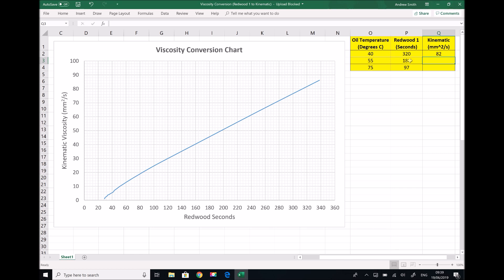We can repeat for 188 Redwood seconds. We have 180 and 5 increments up to 200, so each increment is 4 seconds — we go along 2 squares to 188. Tracking upwards until we strike the line, and then tracking across, our viscosity this time is 48 millimetres squared per second.